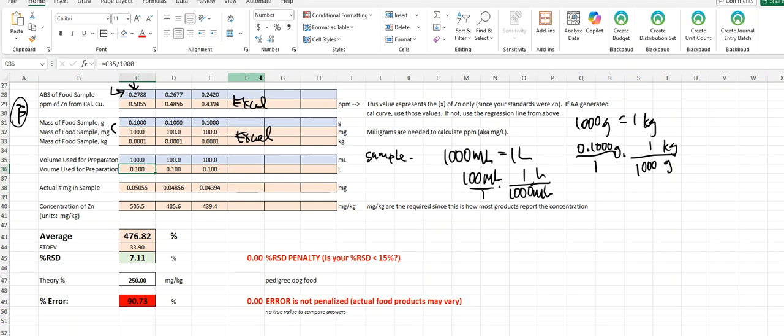So I'm going to take 100 and I'm going to divide by 1,000. Keep in mind, ones don't matter. 100 divided by 1, 100. Times that by 1, same number. Divide it by 1,000. That's really the only applicable thing that goes on. So with this one, I'm going to hit equal, and I'm going to click on 100, and then I'm going to divide by 1,000 in order to give me a liter for that value. So 0.1, there we go. I know you could do that in your head, but it's always good to get Excel to do these calculations.